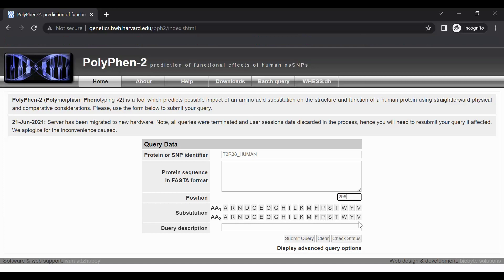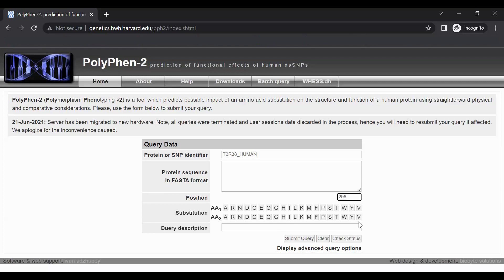The AA1 row represents the amino acid at the variant position in the reference sequence. As a reminder, we are investigating a common TASTER variant that results in an amino acid change from isoleucine to valine. So for this TASTER variant, select I for isoleucine in the AA1 row.